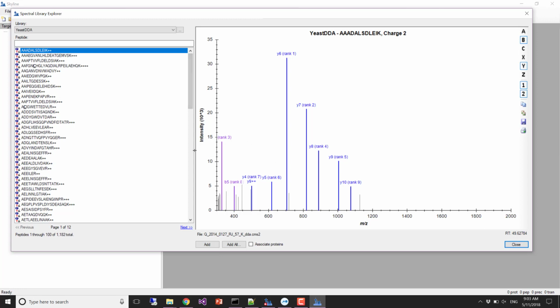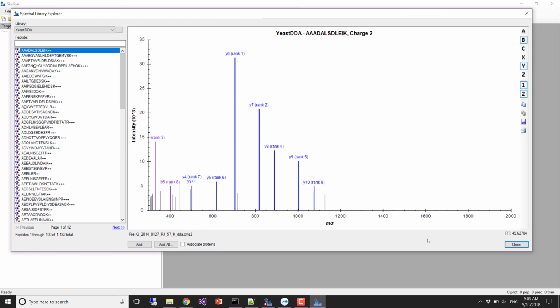They're usually pretty easy for us to fix, but we need to know about them, and you need to be conscious enough of what you expect in a library. One of the things is that your time is in the right scale. So now that we know that we have that, that's a good thing.